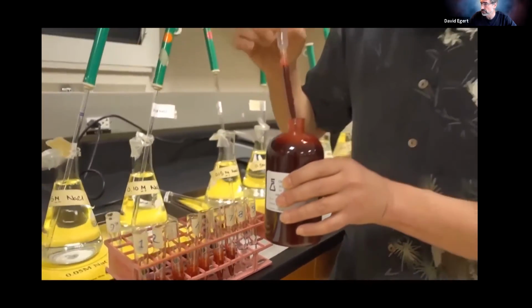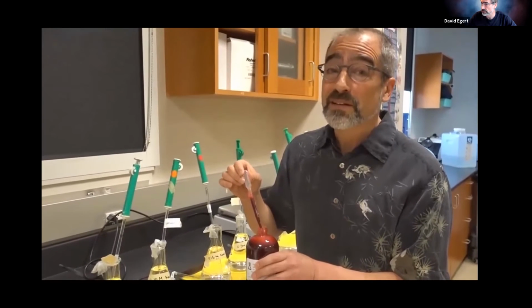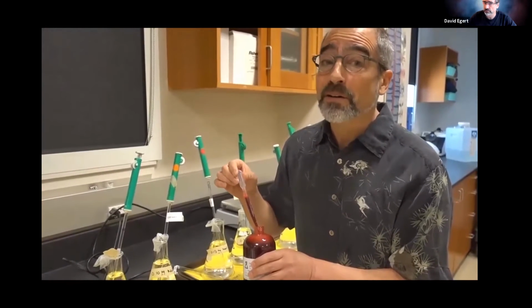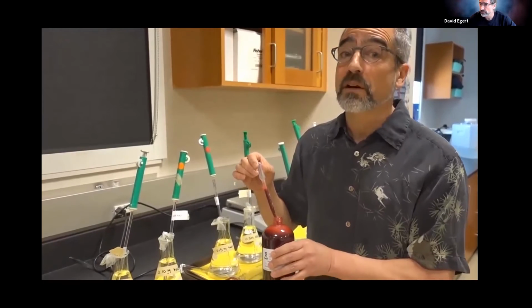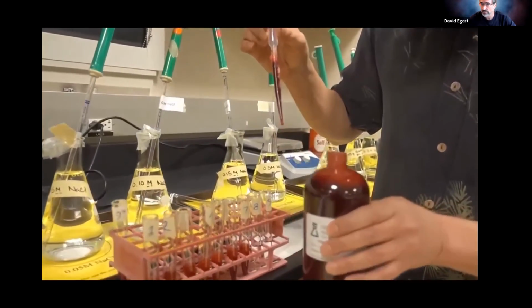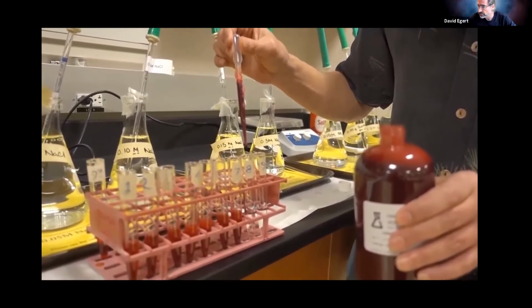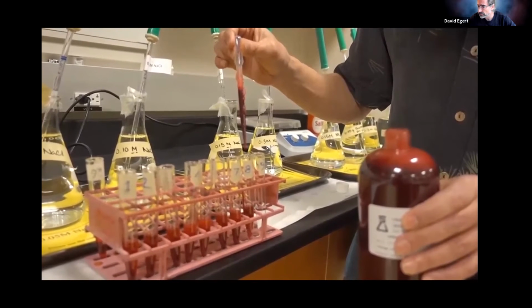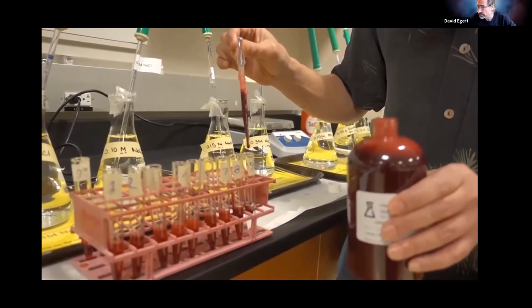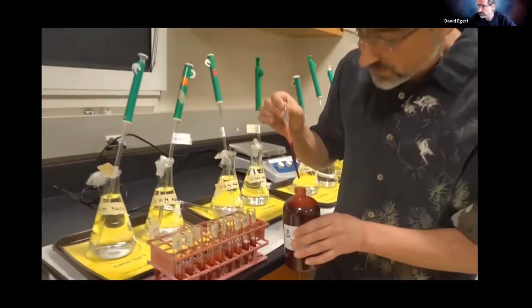Notice I'm also refilling before it's empty, so I don't get into a weird position where I've done part of the drops and get foam coming out, and then it's not a well-formed drop. So I'm trying to preemptively make sure I get 6 well-formed drops. 1, 2, 3, 4, 5, 6.